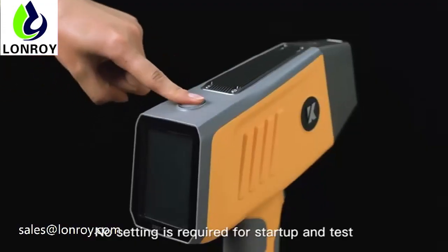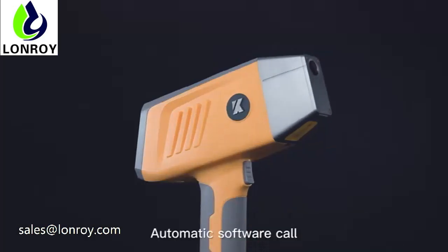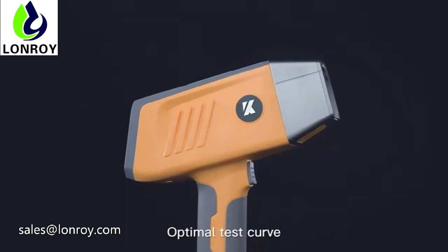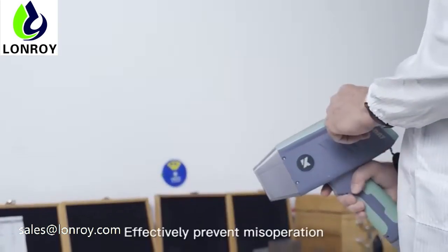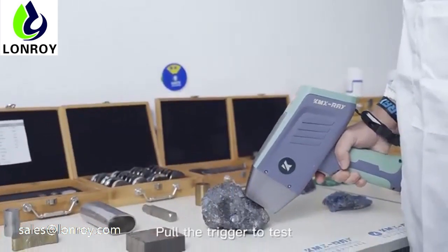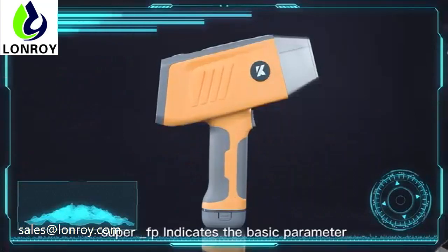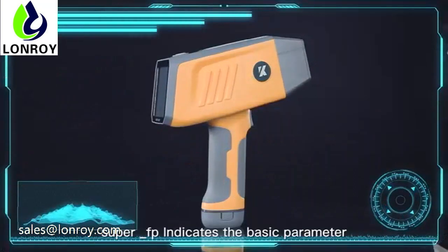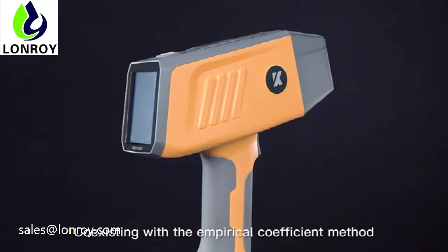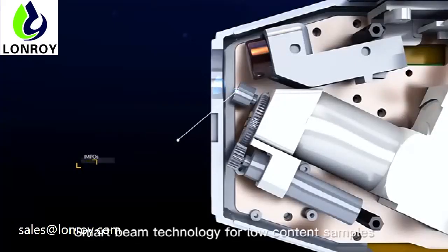No setting is required for startup and test. Automatic software calls the optimal test curve to effectively prevent mis-operation — no training required. Simply pull the trigger to test. Super FP mode combines the basic parameter method with the empirical coefficient method.